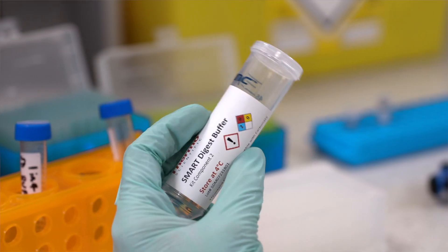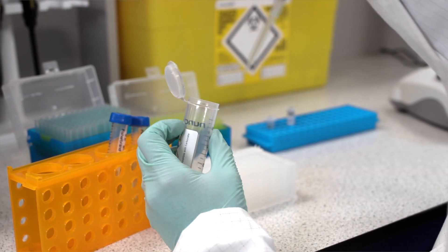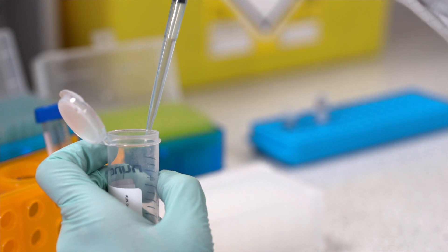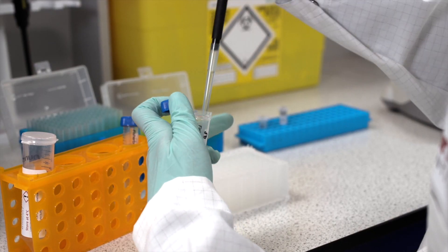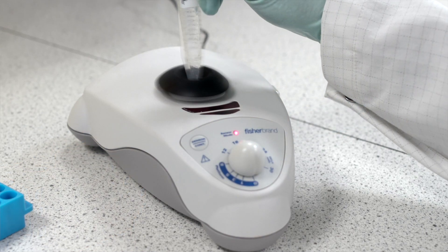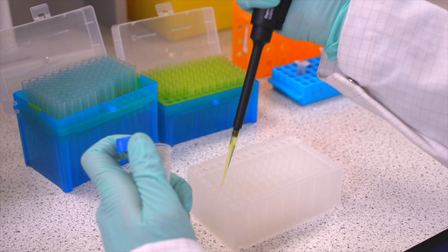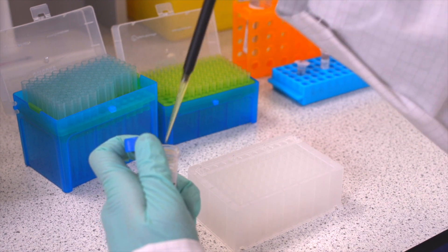Next, dilute Smart Digest buffer in highly purified water at a ratio of 1 in 4, and add 200 microlitres to row E — this will be your bead wash row.